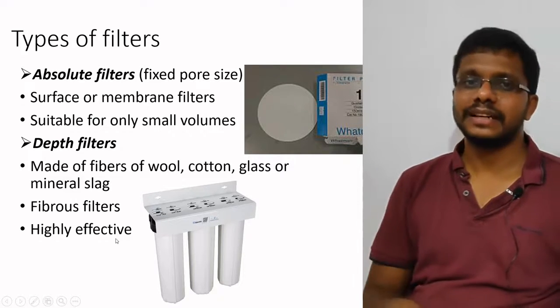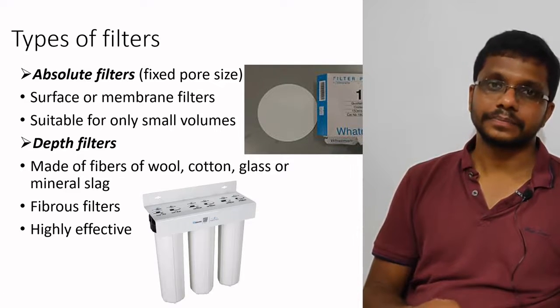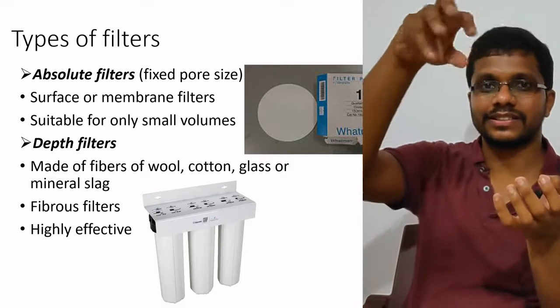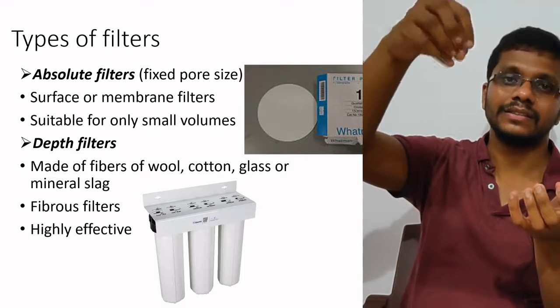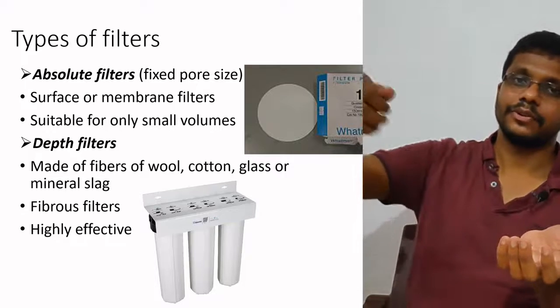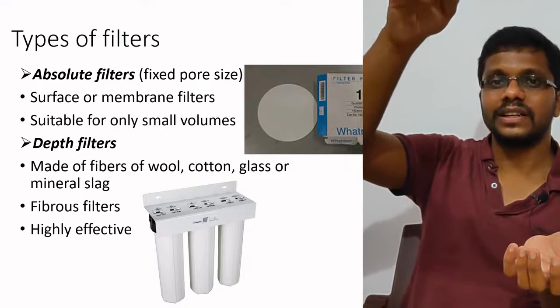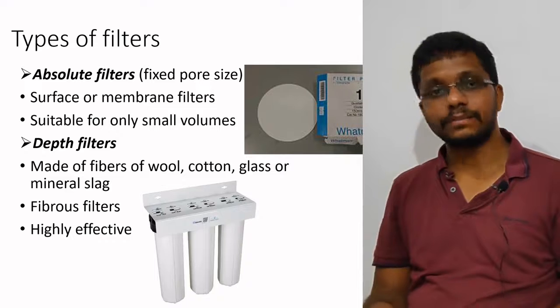You might have done a few experiments in your childhood days, like you take some small containers or coconut shells and you put some coarse particles, some pebbles in one, then we put sand, then we put clay. When we have arranged them serially, and if you put cloudy water in the top one, it will get purified step by step. So that's the depth filters.